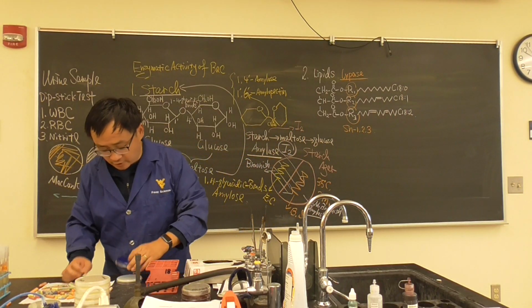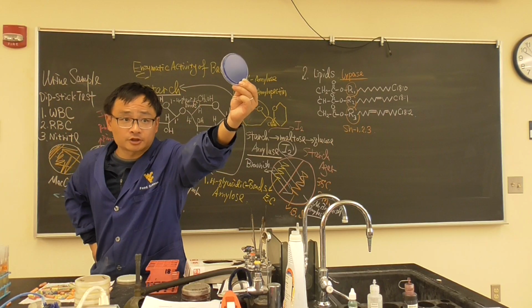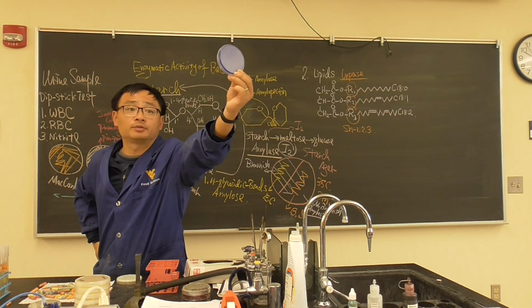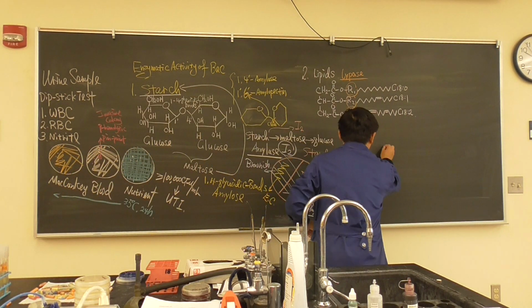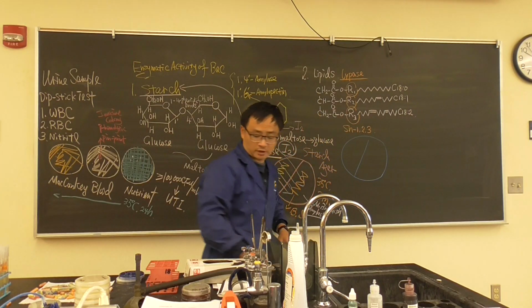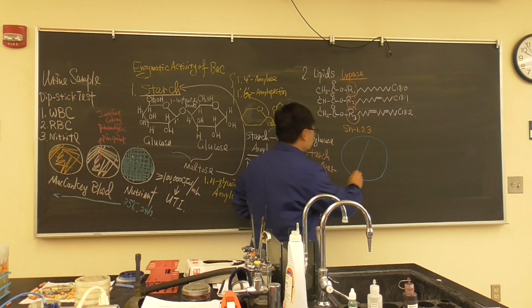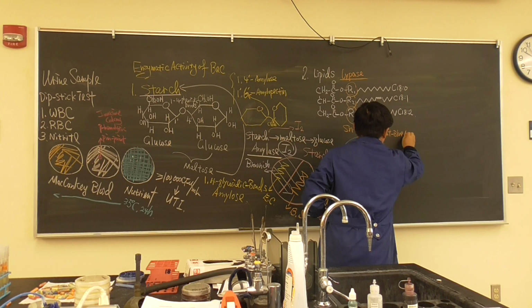This time we're using a very shiny, beautiful agar. That's called spirit blue agar because it's blue. So we're going to use a blue color. So what do we do? Split them into two, same thing. This is called split spirit blue agar.